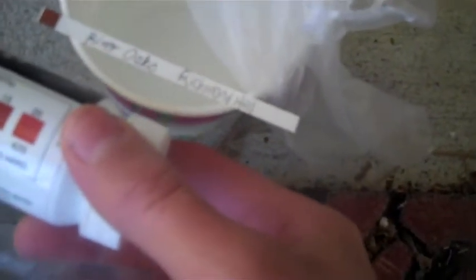Okay, dip for 1 full second. Shake off the excess. And let's see. Looks like we got the same as Mulberry neighborhood. It's hard, but not as hard as Piercefield Forest and White Hill Village. Or White Oak Village, I think it was. So, kind of interesting. All city water and all slightly different.